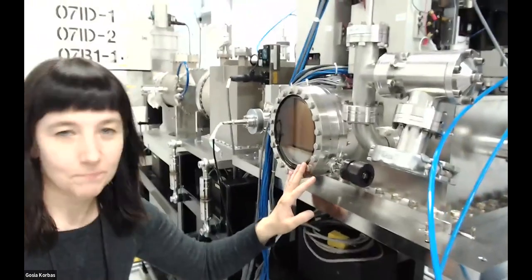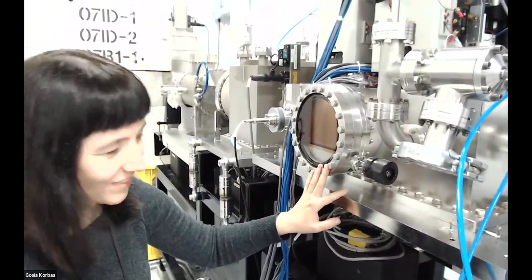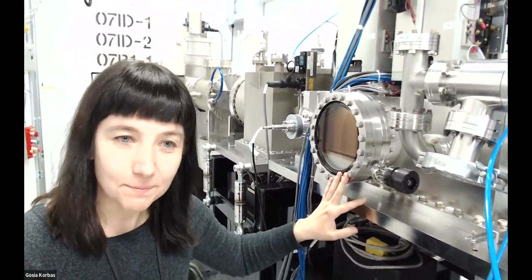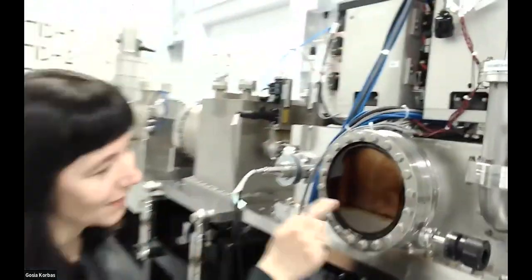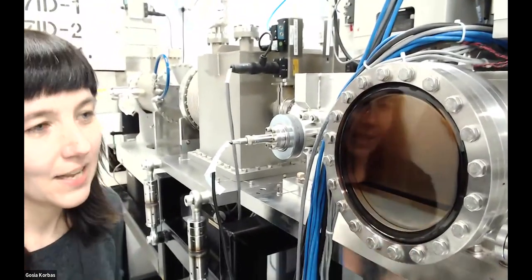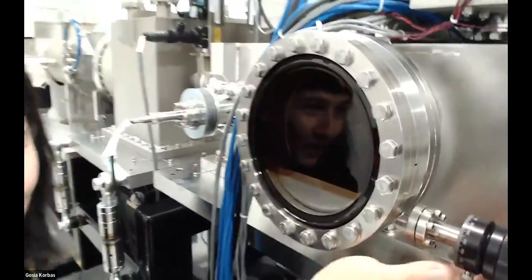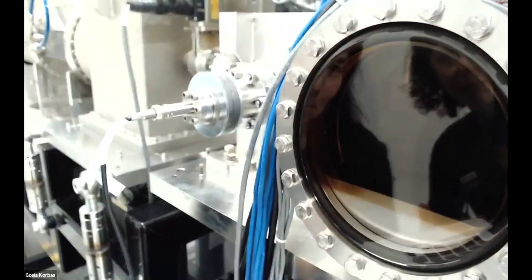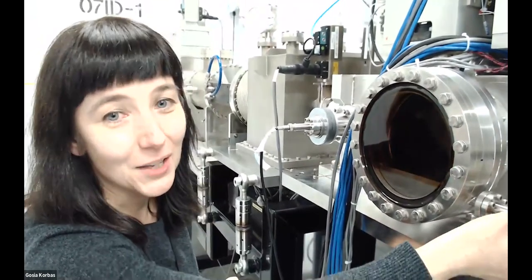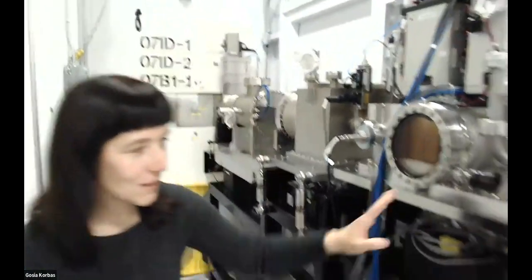Here we have a place where we have diamond filters, and we use those diamond filters to filter out a portion of radiation that we don't need. And you can see that the light that comes is quite powerful. It browns the glass on the viewport here. So let's follow, and then here you can see when we open, you may not really see, inside we have those diamond filters. What happened was that normally it should have been closed, but a couple of times we forgot. And we left it open, and that's why the glass got brown. So I close it now. So let's follow the beam path.